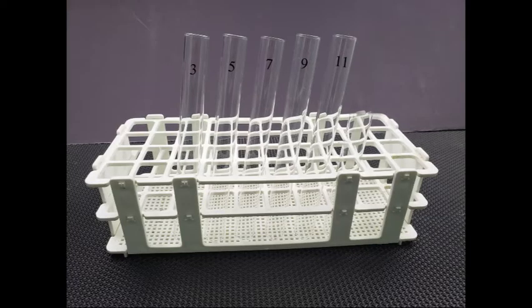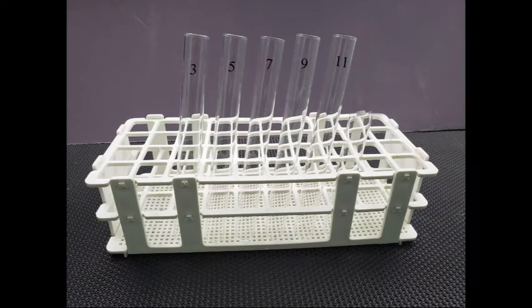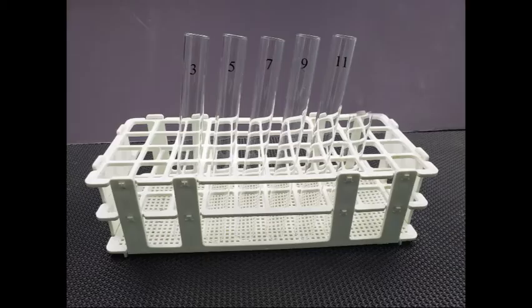Use a clean graduate cylinder to measure separate 40 drops or 2 milliliter portions of pH 3, pH 5, pH 7, pH 9, and pH 11 buffer solutions and pour the portions respectively into test tubes 3, 5, 7, 9, and 11. Remember to wash and drain the graduate cylinder after measuring each buffer.